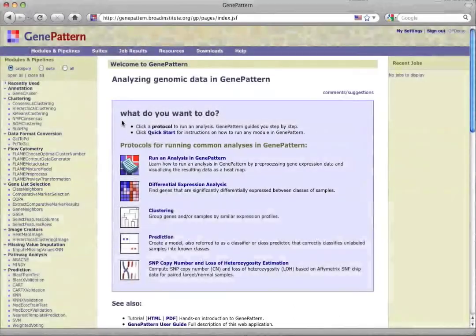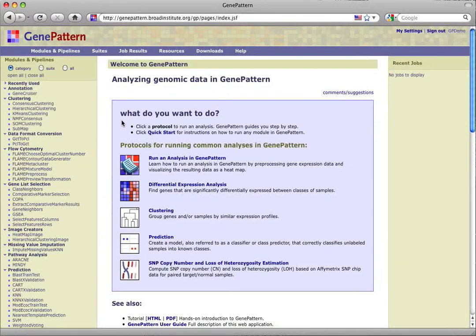On the GenePattern homepage, you find the protocols in the blue highlighted section in the center of the page, which asks, what do you want to do? We know that we want to cluster, so we choose clustering.